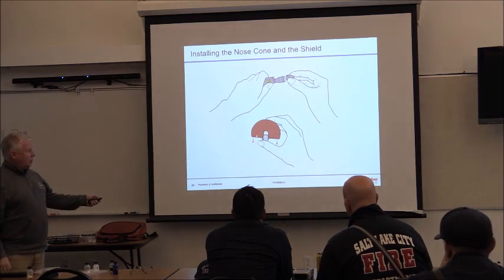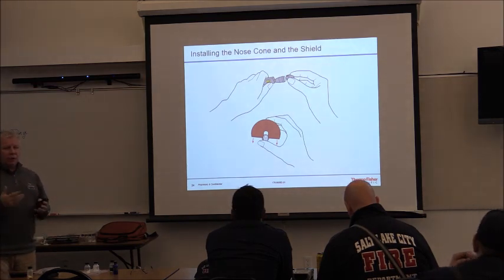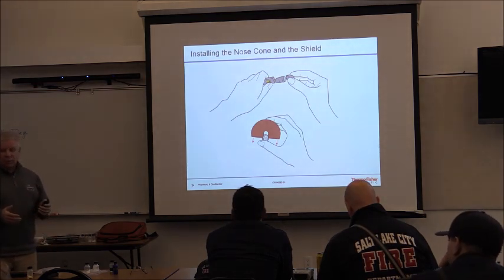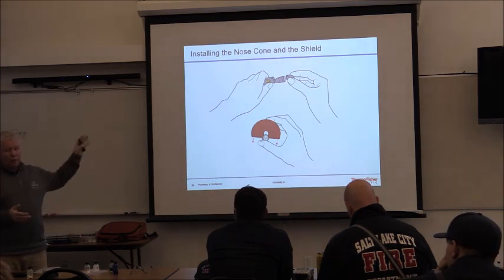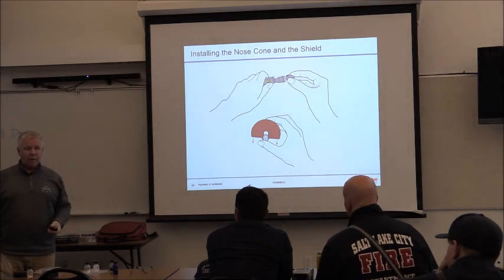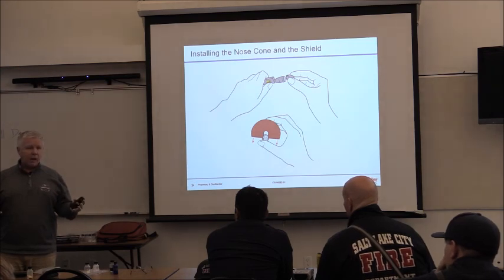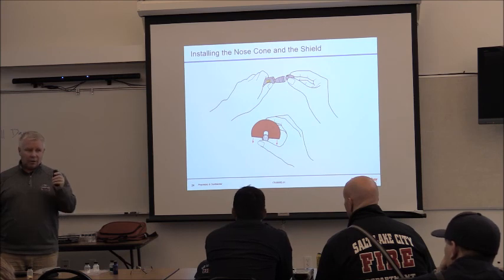The nose cone has a shield that goes with it. The shield can slide off. The shield is just a reminder that you're dealing with a laser. So you've heard the old cliche, never point a laser pointer in your eye, right? Do not point the Raman probe or the laser from the probe in your eye. What happens if I hold a laser pointer in my eye for a period of time? It could cause some type of damage, right? That is shooting about 1, maybe 1.5 milliwatts. The probe is shooting 250 milliwatts, which is significantly stronger than this.